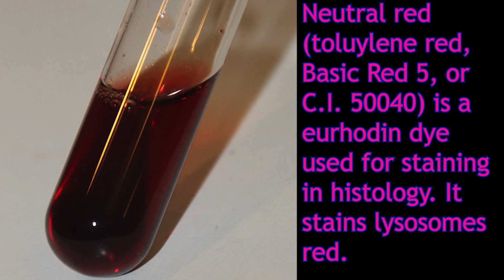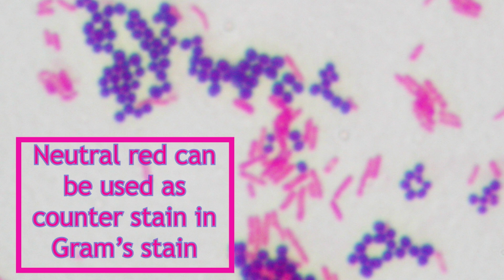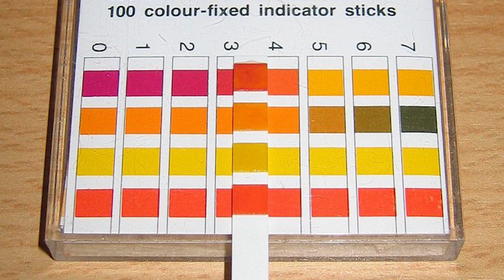Neutral red. Neutral red is a vital stain and also a pH indicator. A vital stain can be used on living cells without killing them, like reticulocyte stain. Neutral red is also a pH indicator. It is a chemical detector for hydronium ions or hydrogen ions. The color of the solution changes depending on the pH. Neutral red is red in color at acidic pH and yellow in alkaline pH.